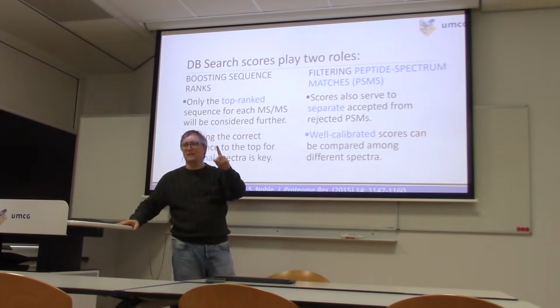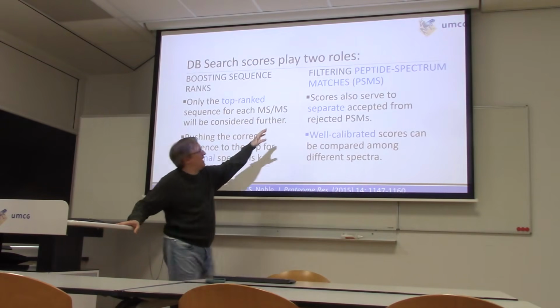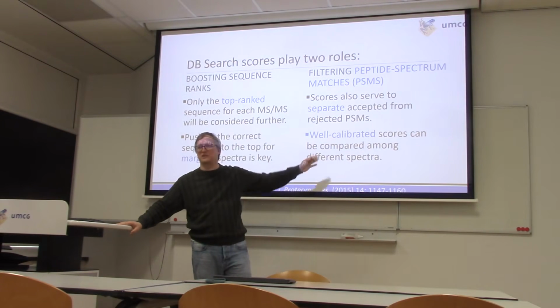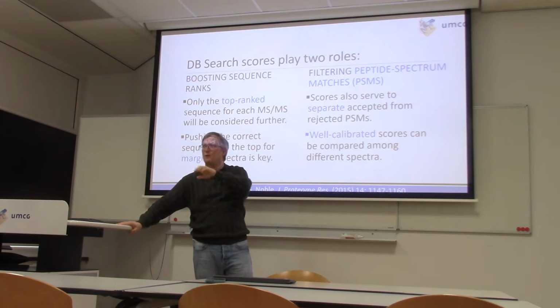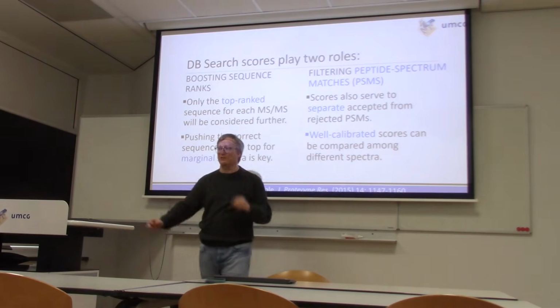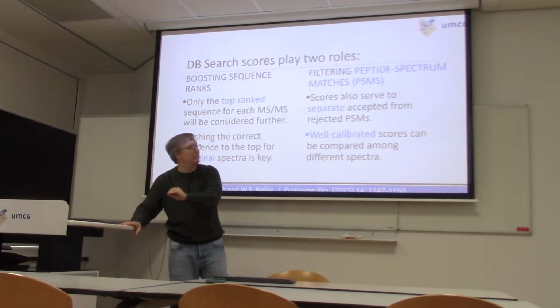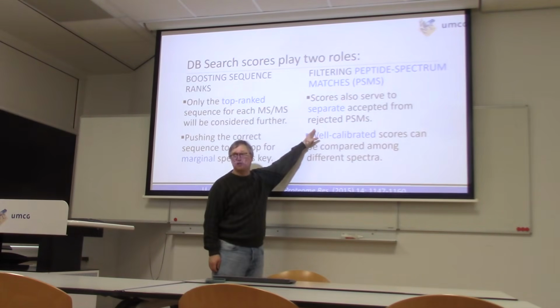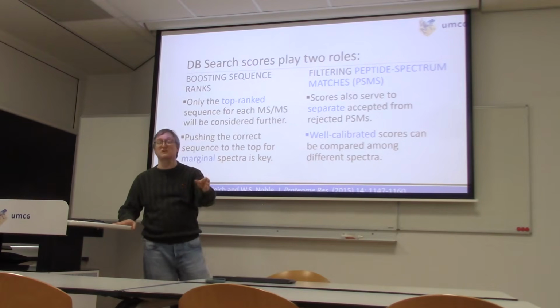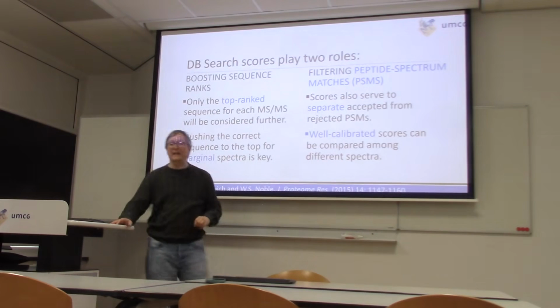Okay, but this is looking at things from the fate of an individual MSMS. I would say that what we actually care about is our aggregate performance. We're not really focused on the information we get from a single MSMS. We want to know how we're doing in the great collection of all the MSMS scans. So for that, we need to be able to filter the peptide-spectrum matches to reflect just those we actually have confidence in. So we're going to use the search engine scores to separate the good stuff from the bad stuff. I'm going to mention, though, that we're going to be using more information than just that provided by the search engine.